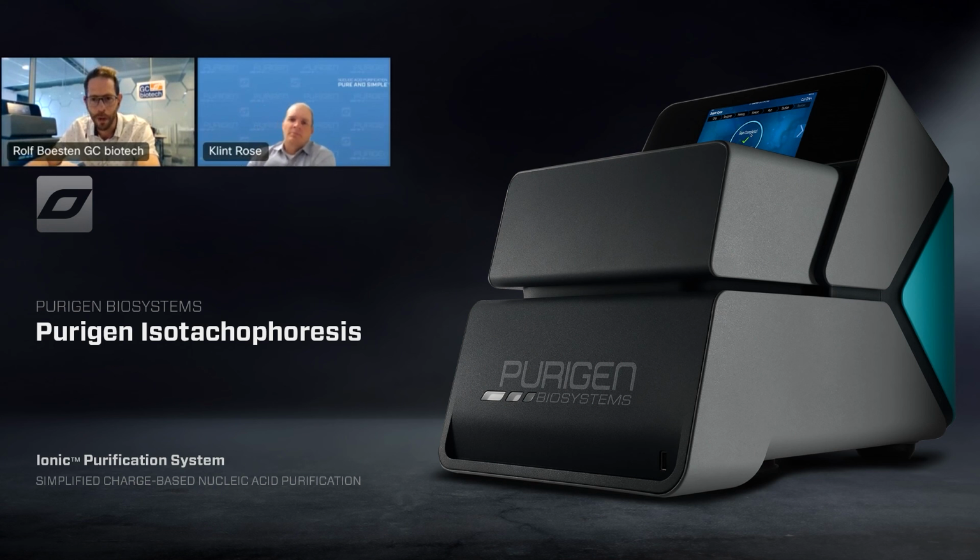Another question from Ronald van Eyck: are you planning to develop a TNA kit? So DNA RNA combined. Yeah, so we don't have an official TNA kit. We have been working with some customers to test out, basically just not including the DNase or RNase as we do the FFPE Complete extraction. And so if you're interested in that, that's an opportunity where we can potentially do some testing with you to see if it works well for your particular application.